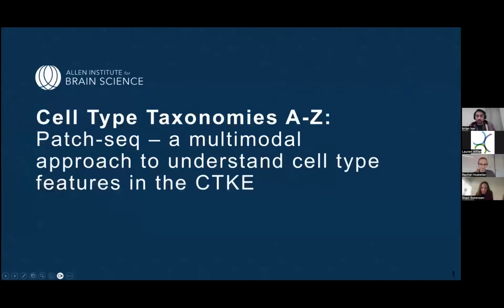Like Rachel said, my name is Brian. I'm a senior scientist in the Integrative Cell Physiology group here at the Allen Institute. And I have a team of patchers where we conduct Patch-Seq experiments. So today I'm going to take a few minutes to chat about what that technique is and how we can look at some of that data and understand what's actually in the CTKE.